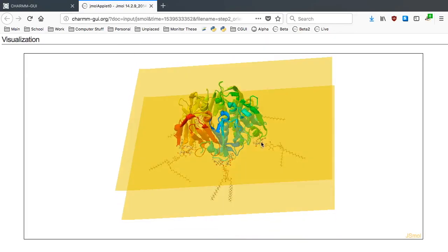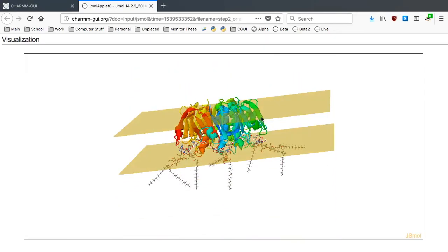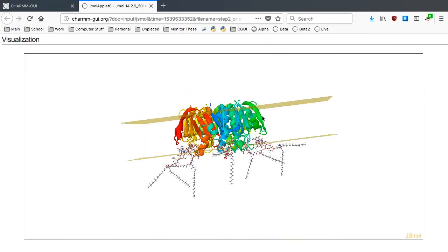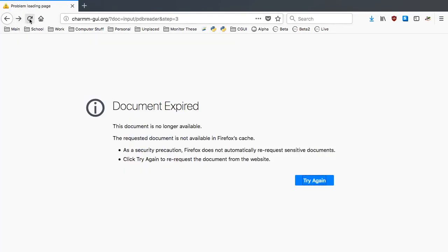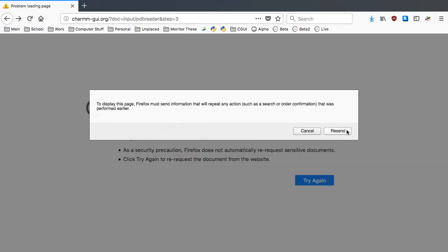Now the 5-fold axis is aligned along the Z-axis, which is the membrane normal vector, but the protein is inside the membrane, although it should be above the membrane.